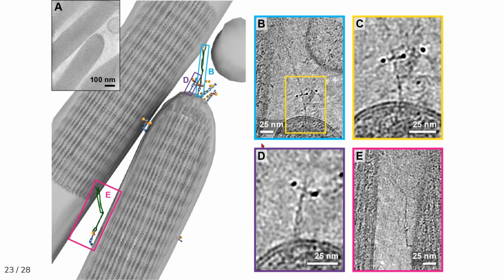And in only one of our 500 tomograms, we found an arrangement where it looked like a tip link was still intact. So we had one stereocilium shaft, one stereocilium tip, and of the multiple protocadherin-15 molecules at the tip, one had an extending density that inserted into the longer stereocilium, whereas the other copies were unbound by cadherin-23.